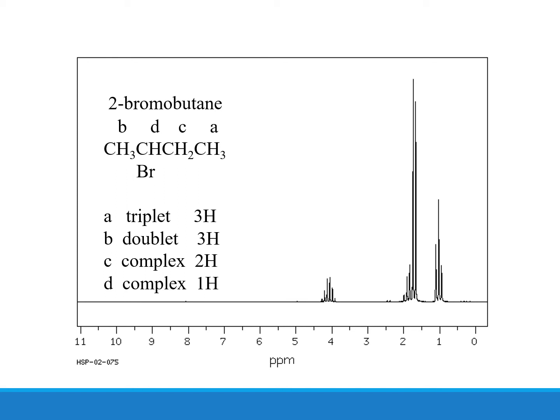2-bromobutane has again 9 protons in 4 different environments.